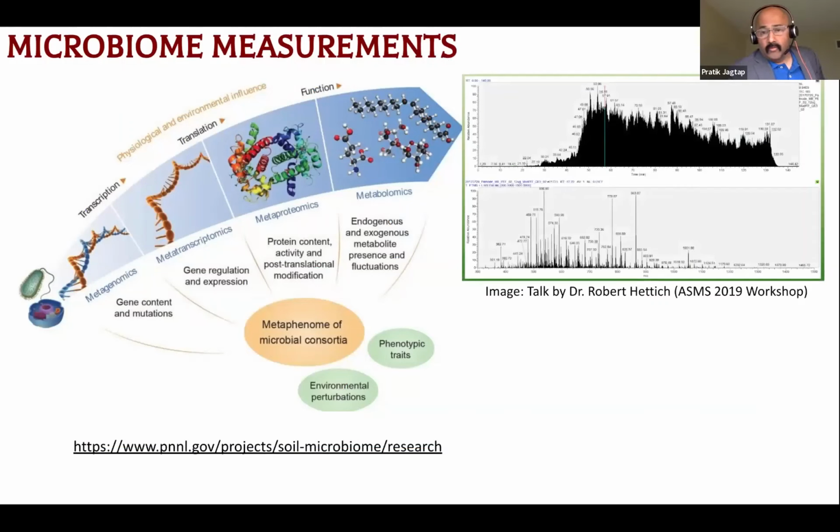As some of you who work in this area of mass spectrometry will definitely see here, there is a lot of data here, and it gets very complex, especially if you look at the chromatogram of these data sets. You'll see that you're not only looking at spectra coming from a single organism, but from multiple organisms. So your complexity really goes up manifold.